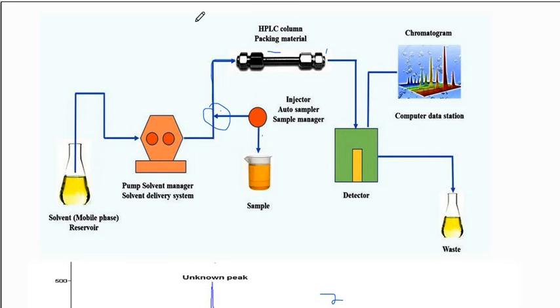The detectors come in different forms. We can have the UV detector, which is basically used to detect the conjugation properties of the compound. We can have the refractive index detector, which basically detects the ability of the sample to refract a particular light. We can have the mass spectrometer detector, which displays the property based on the molecular weight of the sample. Then we have other detectors.